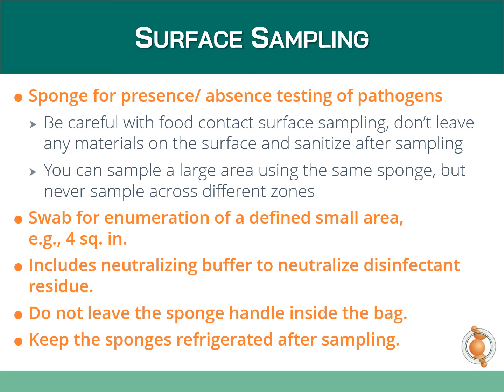Be careful while sampling food contact surfaces. Don't leave any residues on the surface and sanitize after collection of the sample. Also keep in mind that you can sample a large area with one sponge, but never sample across zones.